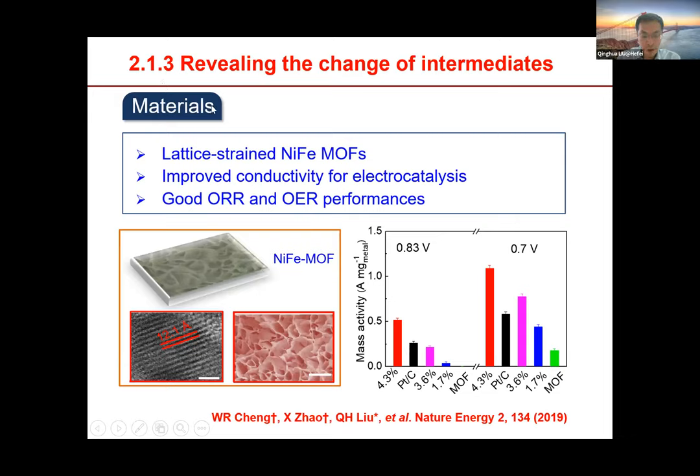The third example is a work that only uses infrared spectroscopy to reveal the change of reaction intermediates in both OER and ORR. I will introduce it briefly. We used a lattice strained nickel iron metal organic framework material as the catalyst. The catalyst shows prominent OER and ORR activity.